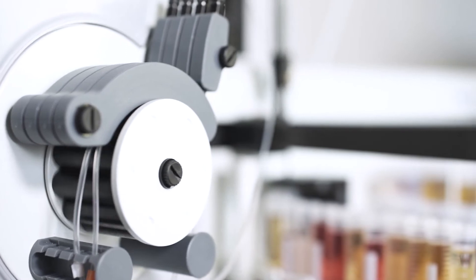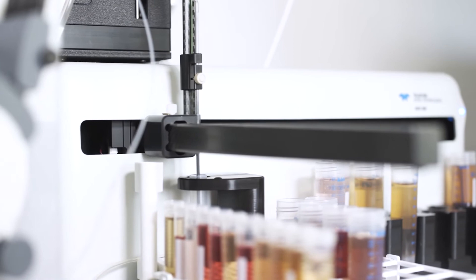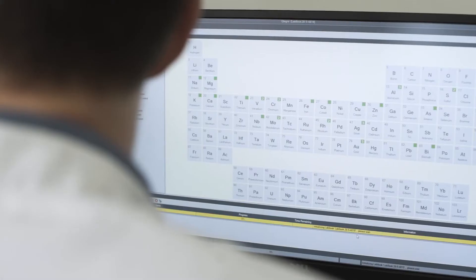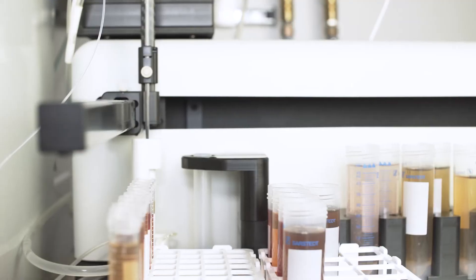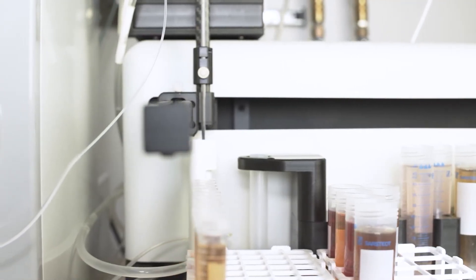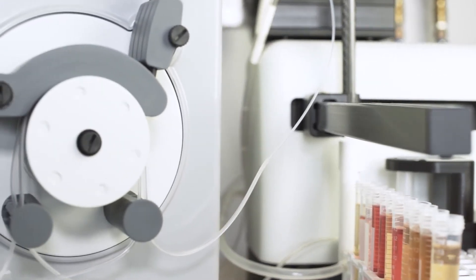The sensitivity ensures easy compliance with global regulations to ensure consumer health and environmental safety. The new platform attains a new level of robustness for the analysis of petrochemical, precious metals, and advanced alloys, delivering ultimate accuracy and precision.